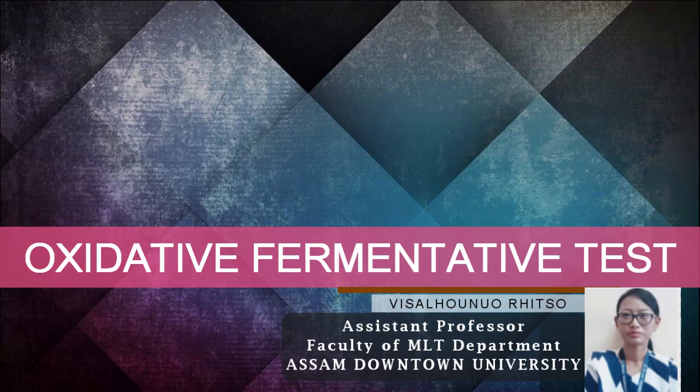Second, the concentration of peptone is decreased from 1% to 0.2%, decreasing the amount of alkaline products produced by the metabolism of peptone, thus reducing the neutralizing effect of these products. Third, carbohydrate concentration is increased from 0.5% to 1%. The increased concentration of glucose in the medium enhances the production of this weak acid to a level that can be detected by bromothymol blue indicator.